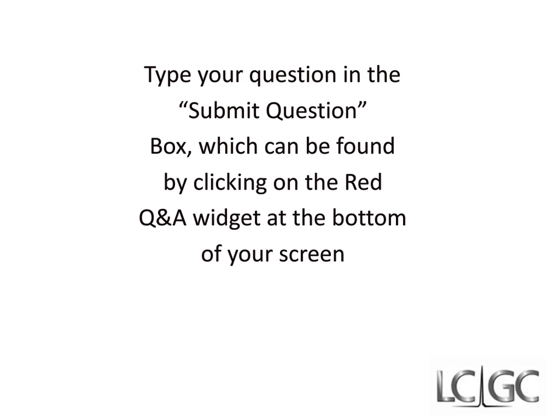That's great. Thank you very much. And someone else wants to know, how can we remove high salt content in the sample?